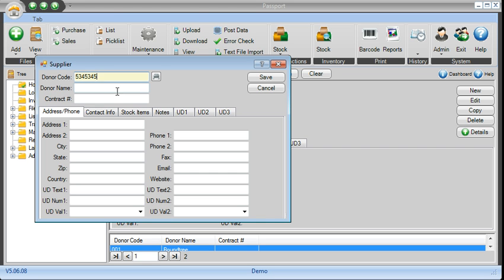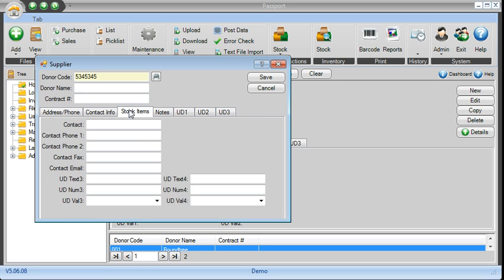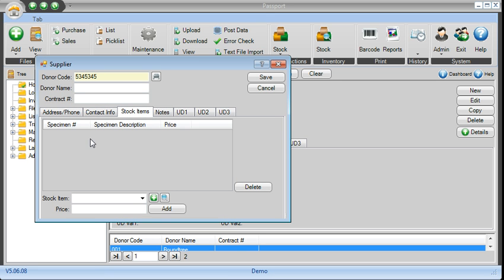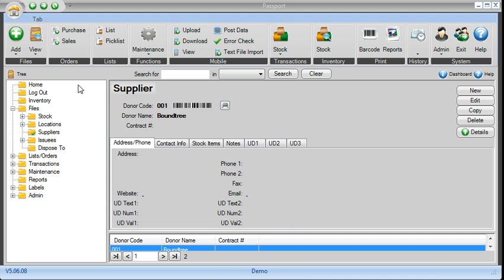So you give the donor a code, you give them a name, any contract number, put in any information you have, you can associate the items that they donated with their number or they're planning to donate here.